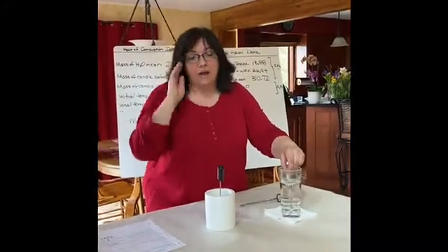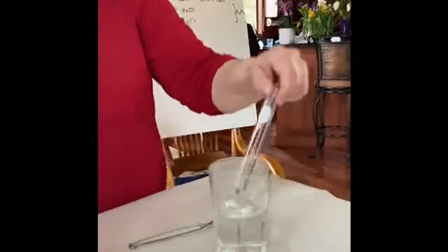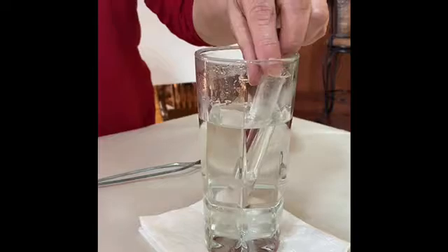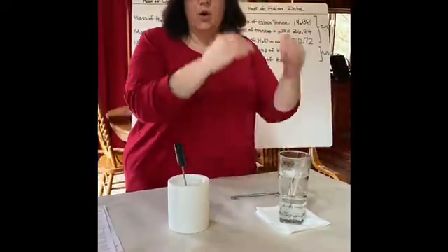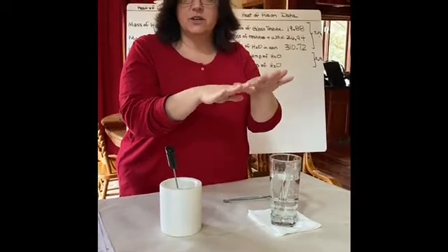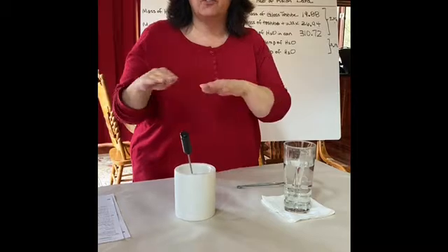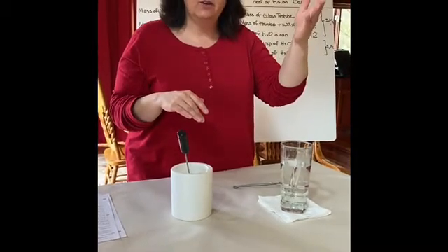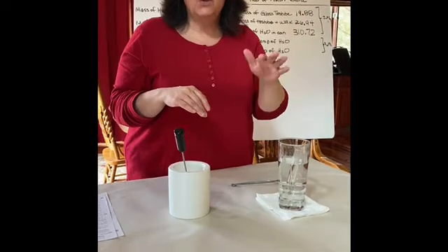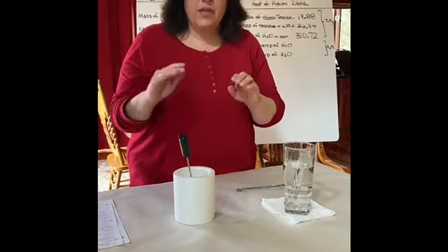So we are back. Our candle wax is completely melted now. If you wanna come look, you can see that it is completely clear. So now what I need to do is pull the wax out of the hot water, hold it in the air until I start to see it go opaque. Because what we wanna do is collect the data of just freezing. So we don't want the energy that's being released as the candle wax cools. We want the energy being released as the candle wax freezes.